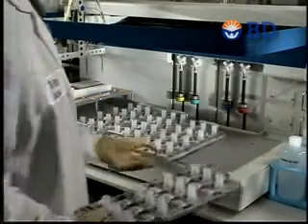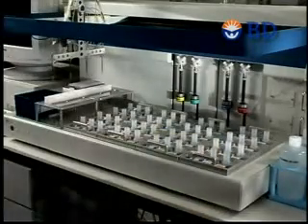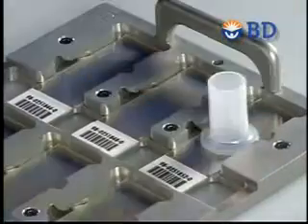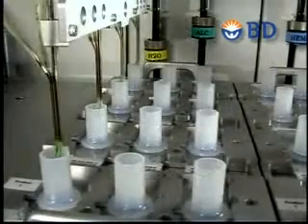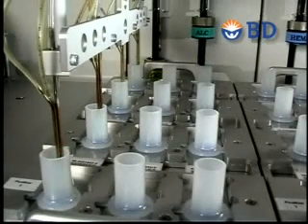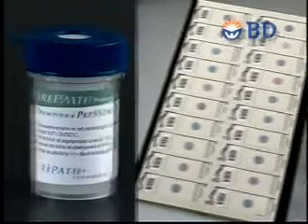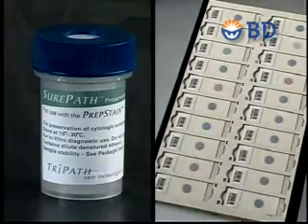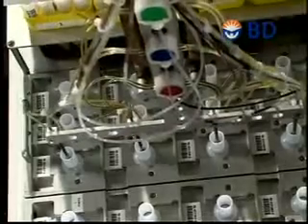The processor can hold up to 48 slides per cycle. Note that all tube and slide racks are keyed and can only be inserted in the correct position. Disposable settling chambers attached to the slides define the 13 mm cell deposition area where thin layer preparation and discrete staining are automatically completed by the PrepStain slide processor. Multiple slides can be generated from one specimen if desired, which is useful for processing non-gynecological specimens and for performing repeat testing. Once the slide racks are loaded onto the PrepStain, automated slide processing can begin.